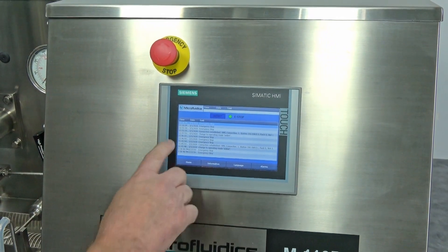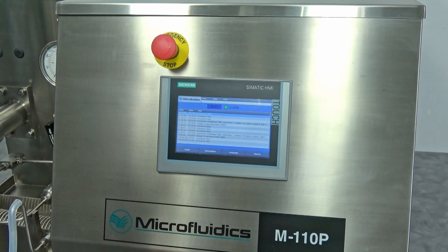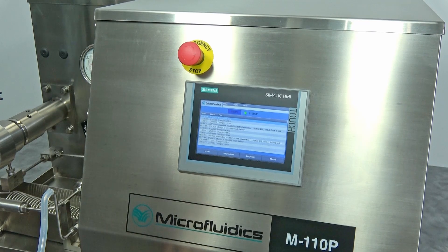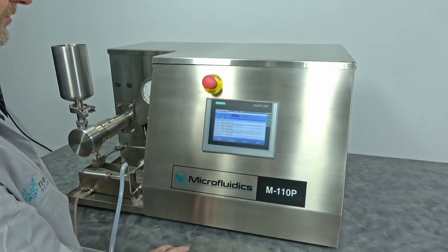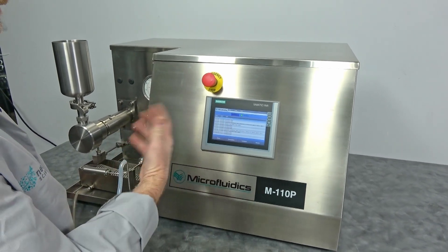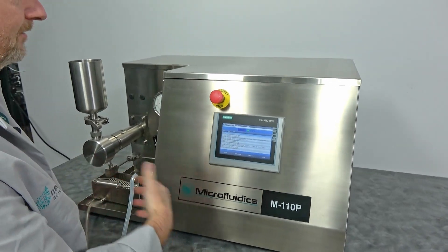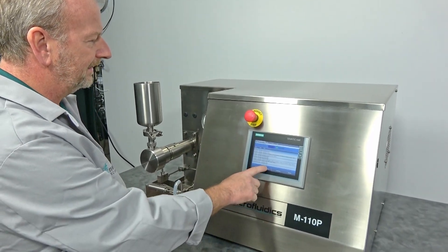That's one of the reasons I think it has so many emergency stops — it is 110V and has kicked some breakers. Having a good designated outlet with a 20-amp breaker is sufficient; it works fine. It looks like it may not have even been used, just plugged in — some entries said 'connection established.' My theory is this was right before COVID, and with all the lockdowns, maybe a project was getting started and then everything was shut down. Just a theory.